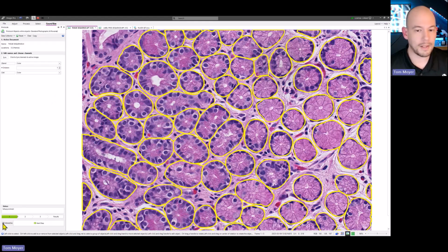If you notice at the bottom, by default, I'm in what's called interactive mode. The first time that you're walking through a protocol, we need to make some adjustments. This could be pointing to different AI models or various configurations within each step. I'm going to walk through this the first time, make those adjustments, save a version that I can now use to batch process a folder full of images. Everything is guided, so in this case, I have 3 steps, and then I have my results step.